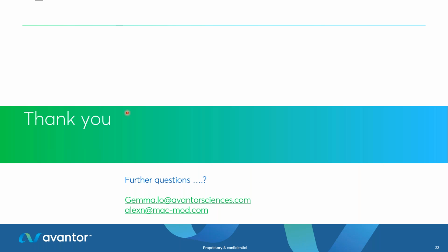But then you have to consider that it's a different mode of chromatography. So you need to optimize the system for that mode, change wash solvents, think about diluents, etc. So it's more painful as a chromatographer, I would say, to shift away from reverse phase, but you can definitely get good retention for more hydrophilic compounds in that case, and maybe some charged analytes too.